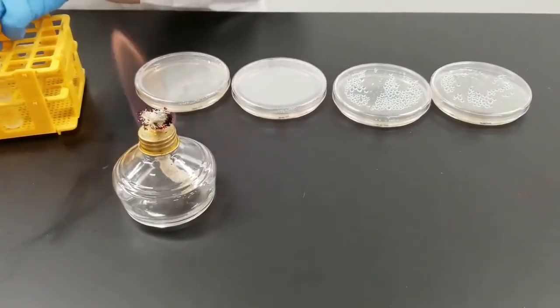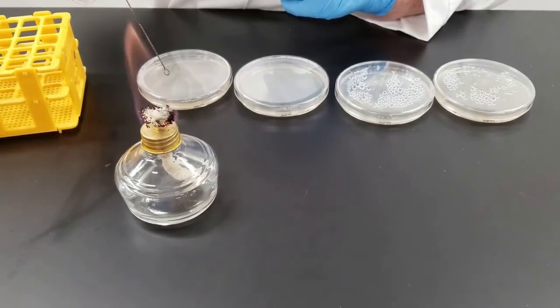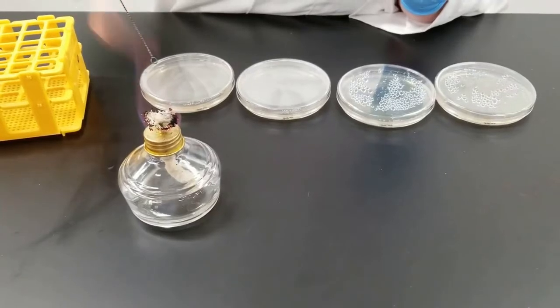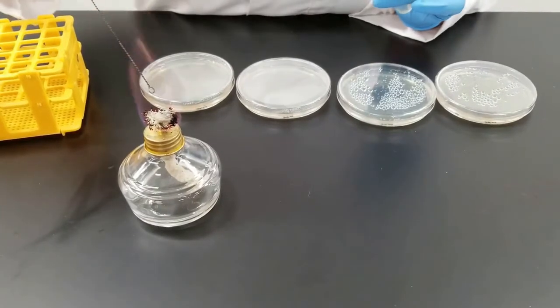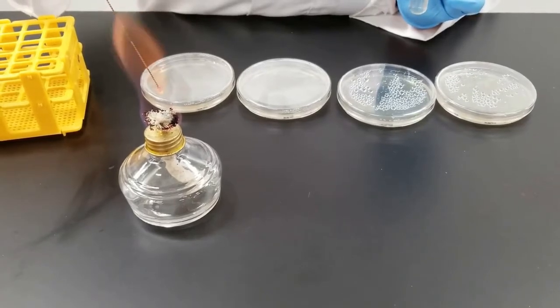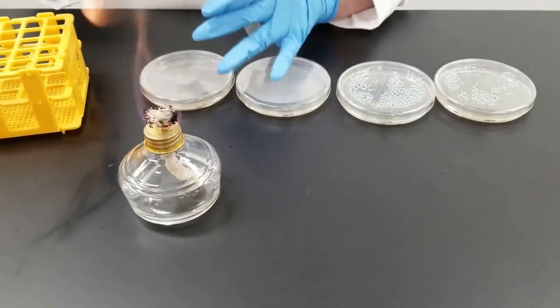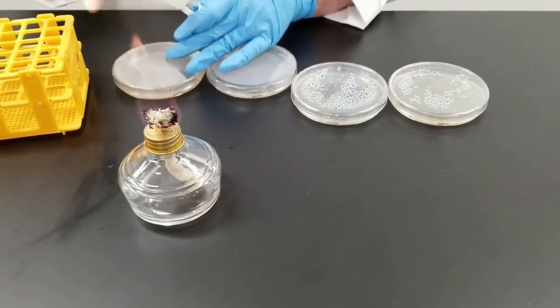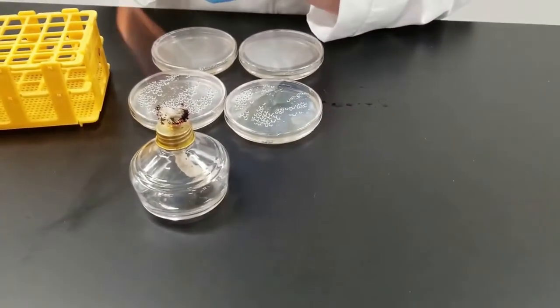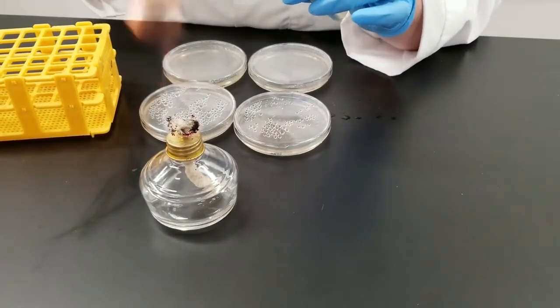I'm going to start with Staphylococcus aureus, and it's in a liquid culture. We're just going to flame our loop as usual, and from the liquid culture just do a simple streak down on the half of the plate on that section that is labeled for it. As always, work near your flame. These will be incubated for 24 hours, and then we will look at the results after that time period.